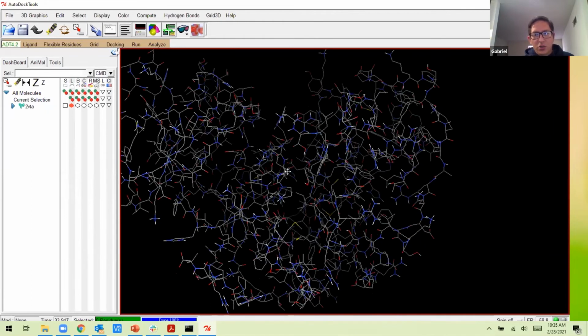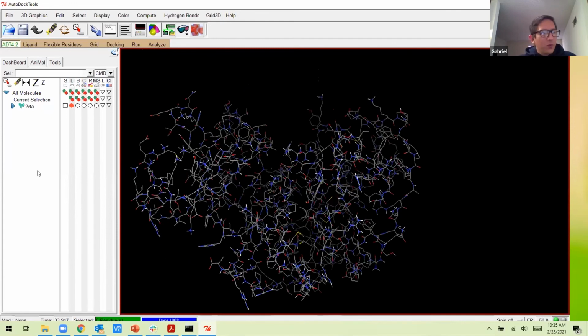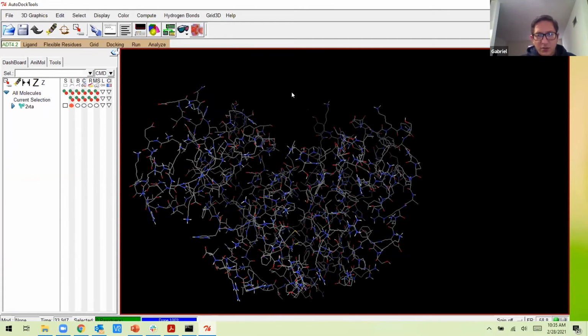Okay, so we have your ligand, we have your protein prepared, and now we have to generate your grid maps and do the AutoDock. So we're going to move to the next part because we are running out of time. So let's move to the next part of the presentation.